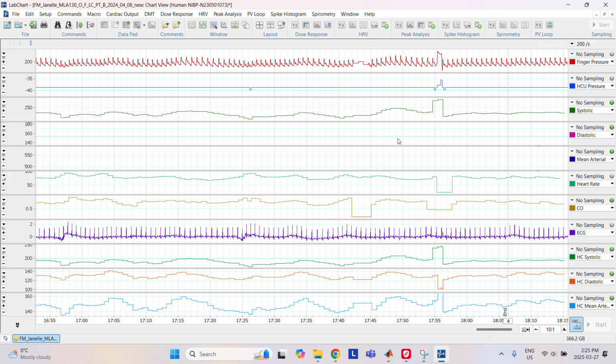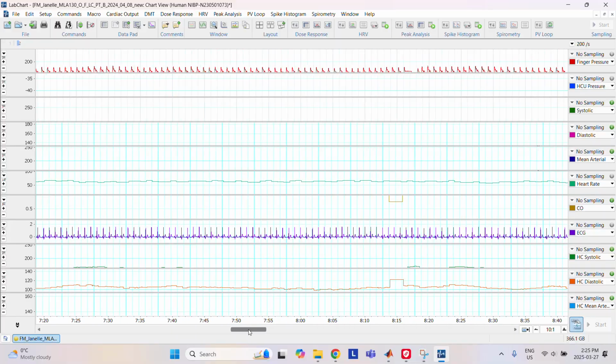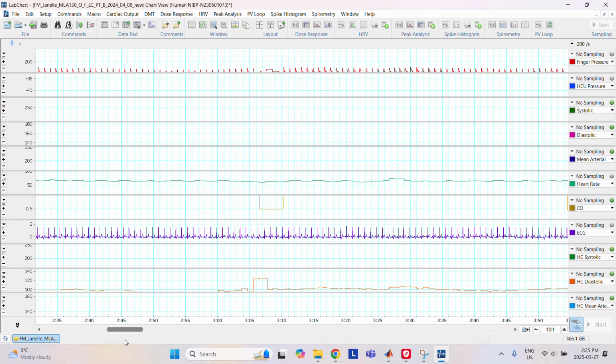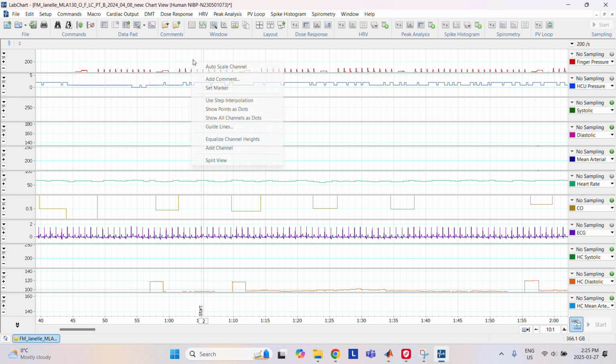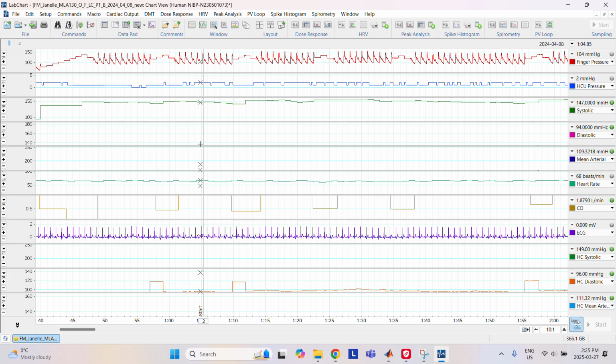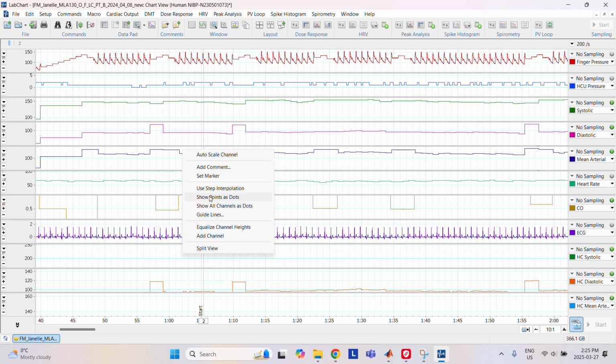We want to auto scale again so we can see everything, and you can see that it's detecting more of the peaks. That's what would have an effect on your height corrected systolic and diastolic once it subtracts the height corrected units. And so I go all the way to the top, to the start, and auto scale again.